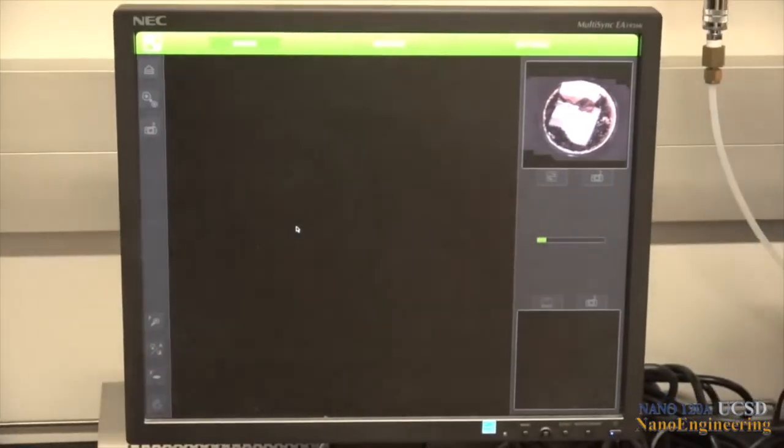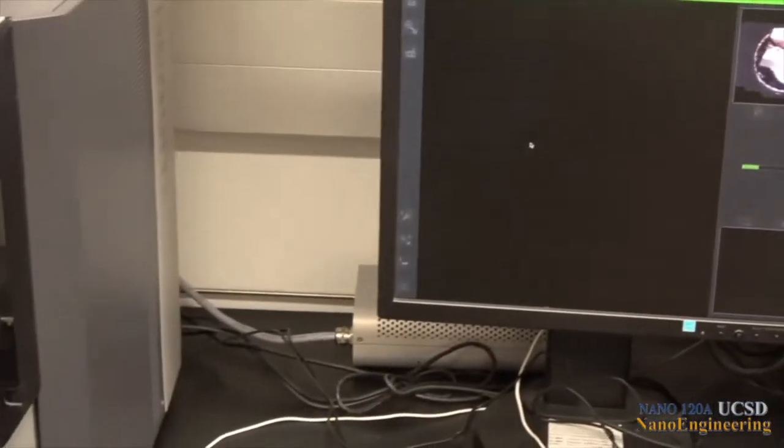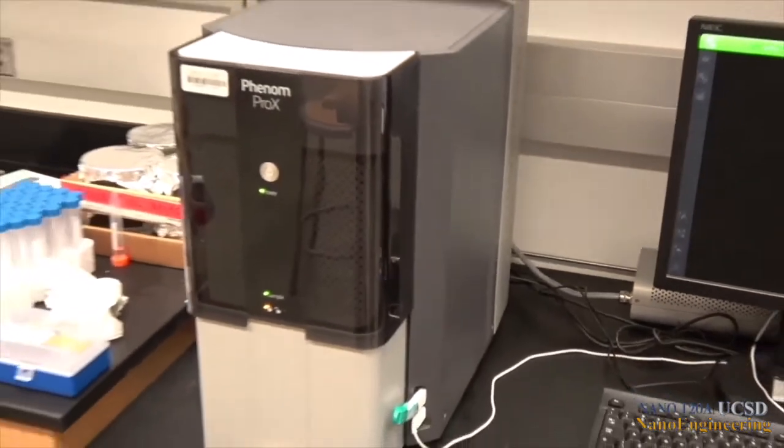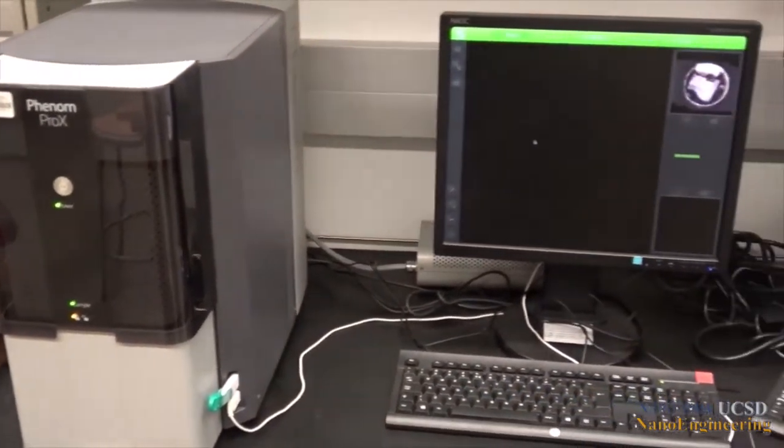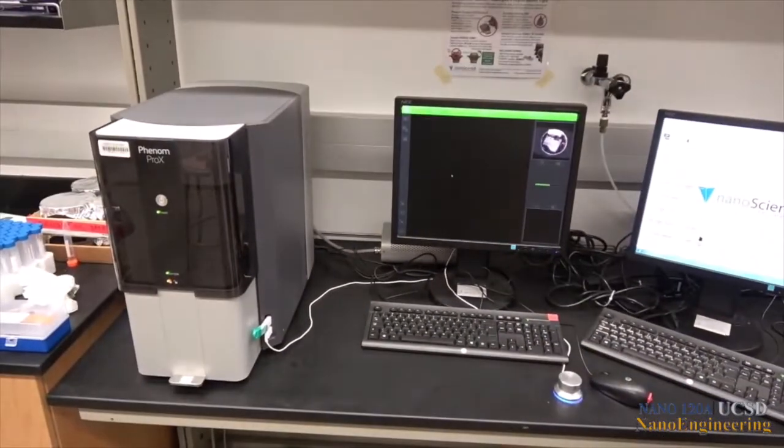The sample will be automatically moved out of the SEM portion of the microscope. A green unlock status light on the front console will indicate when it is safe to slide open the entrance door.